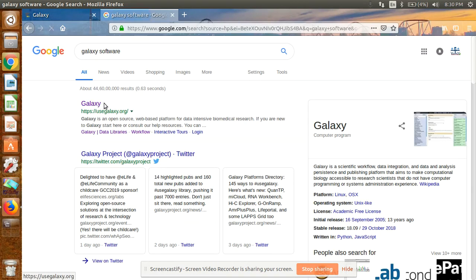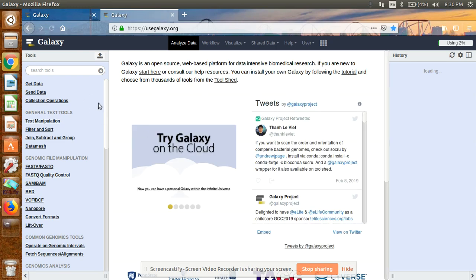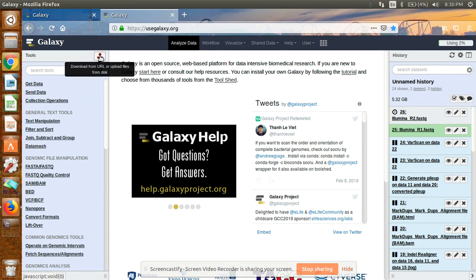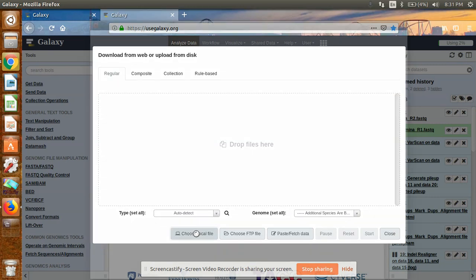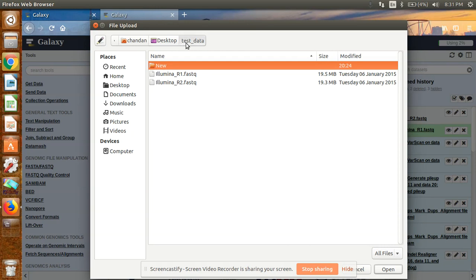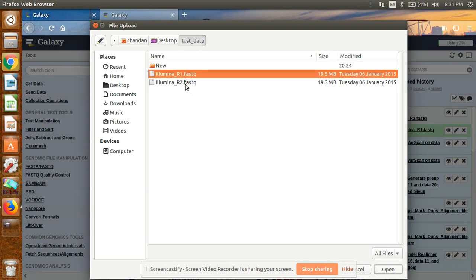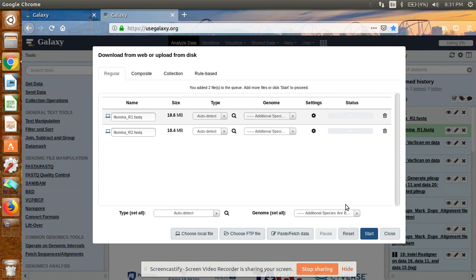You need to go to the Galaxy site — I will give you the link. After going to Galaxy you have to upload your data. The raw sequence data comes in FASTQ format with a forward and reverse file, R1 and R2. From here you choose from your local disk, click here, go to that folder — in my case it is the desktop test data folder — and select the data you want to upload. Select the forward and reverse sequence files and click open.